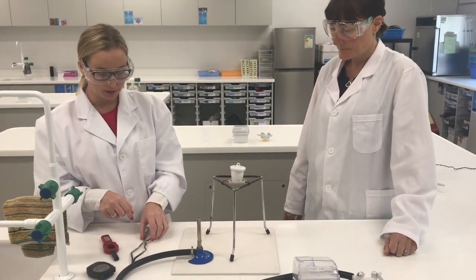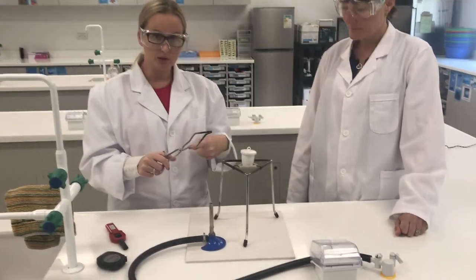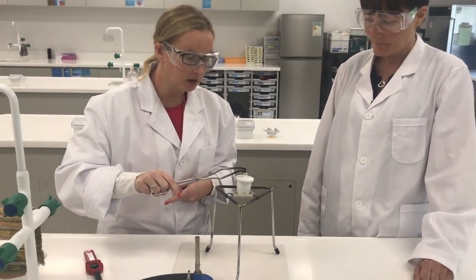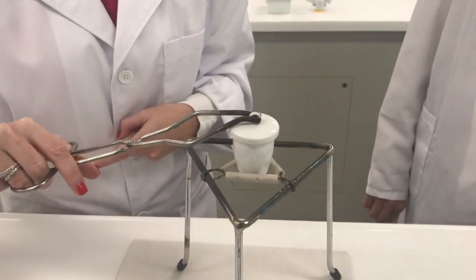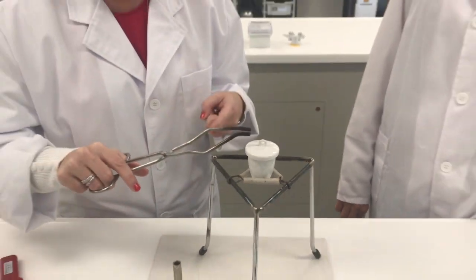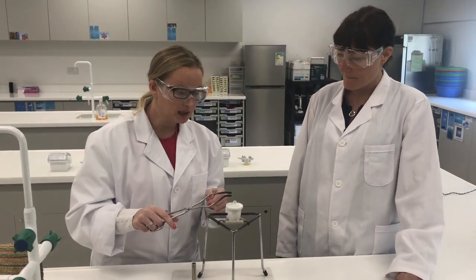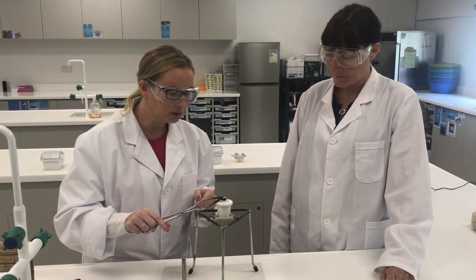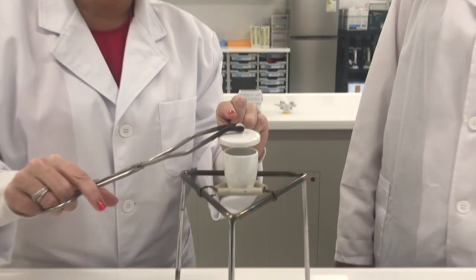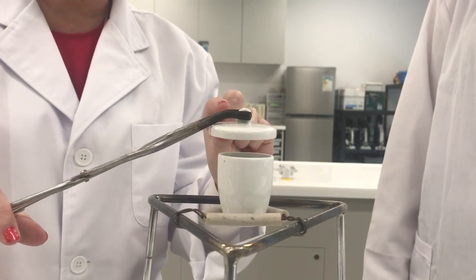Before you light the Bunsen burner, practice using the tongs, because throughout this experiment you will have to carefully grasp with the tongs the handle of the lid and lift the lid up and down periodically, like so, to let oxygen from the air in to react with the copper. You must only lift the lid about 2 to 3 cm above the crucible so that you do not lose any chemical product being produced in the reaction.